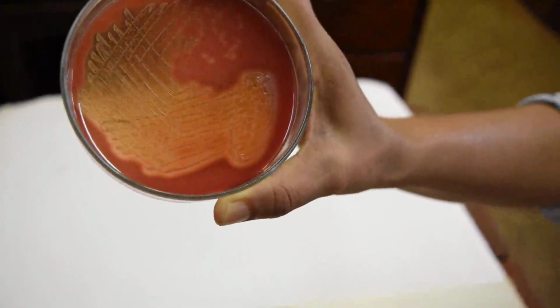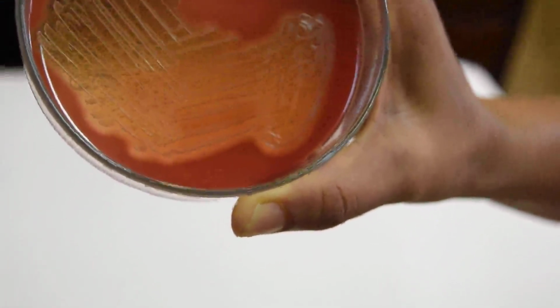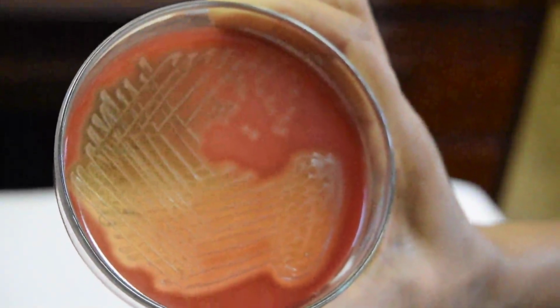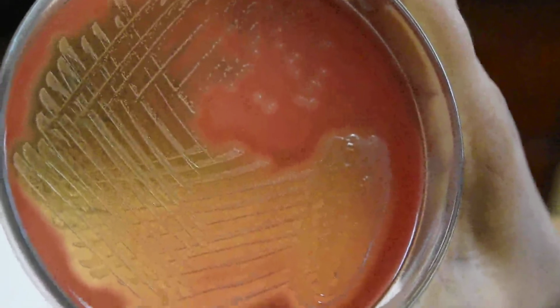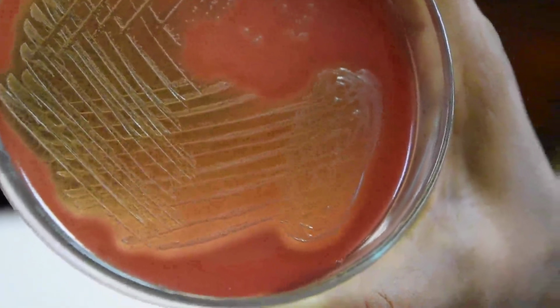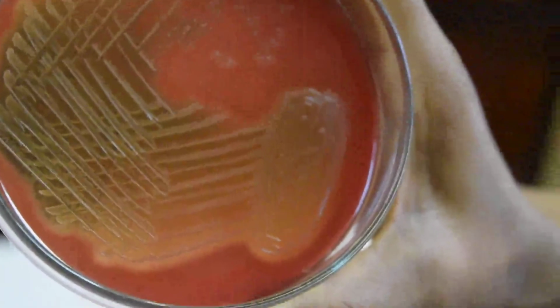Around the pinpoint colonies, you can see a large zone of clearing. The blood is hemolyzed, the red cells are lysed, so you can see through even the hemolysis area. It's transparent. Is it clear? This type of hemolysis is called beta hemolysis.